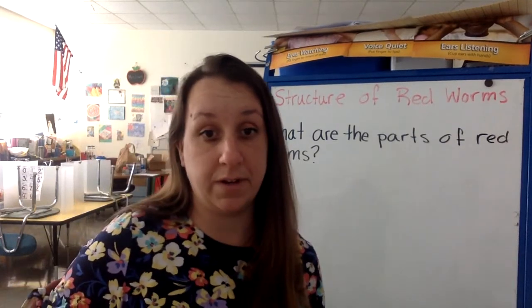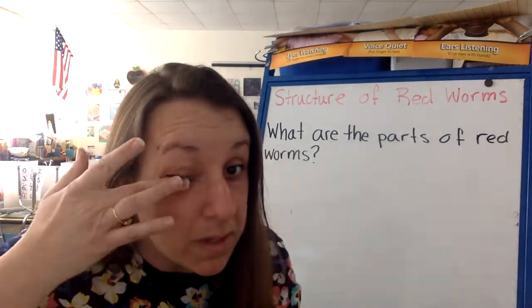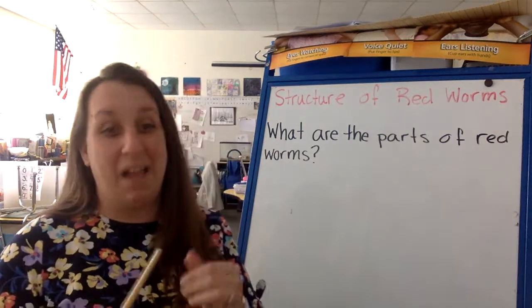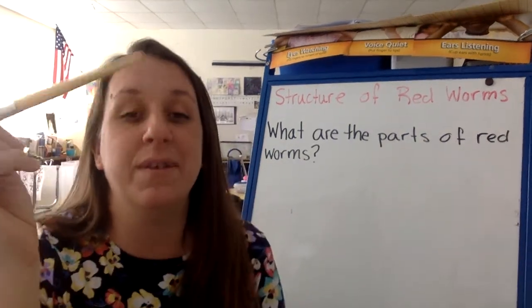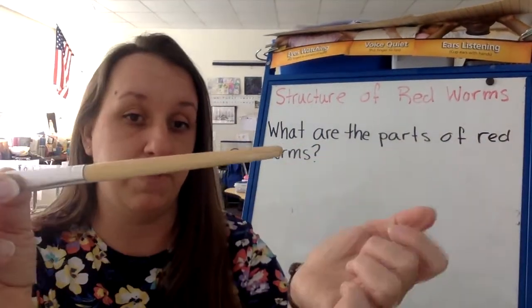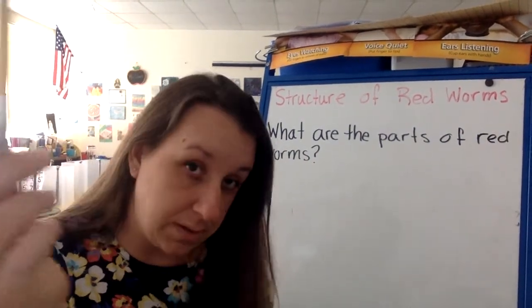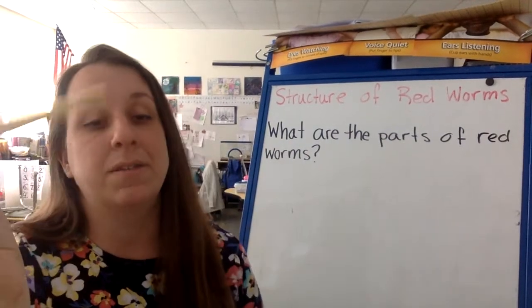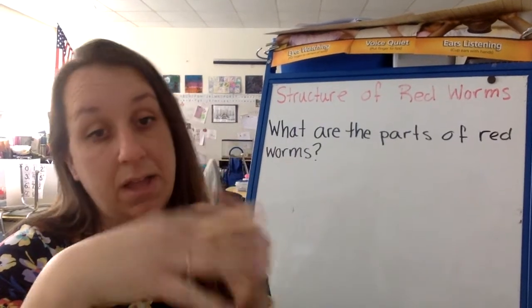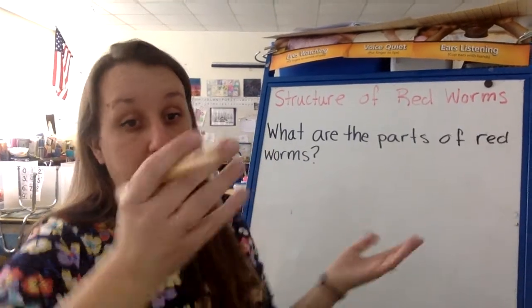Optional, if you don't want to use your fingers today. I'm just using the end of a wooden paintbrush because it's nice and smooth, no sharp parts on it. If you have a popsicle stick or something like that, you can use that to handle the worms instead of your fingers. If you have plastic gloves because you don't want the worms to get on your skin, put on some plastic gloves as well, but I'm just going to use my hand.